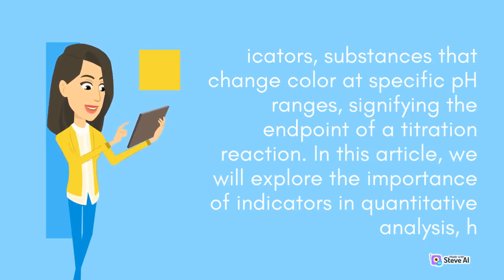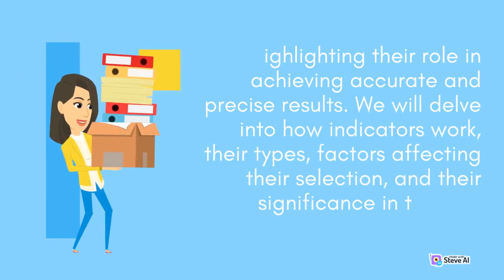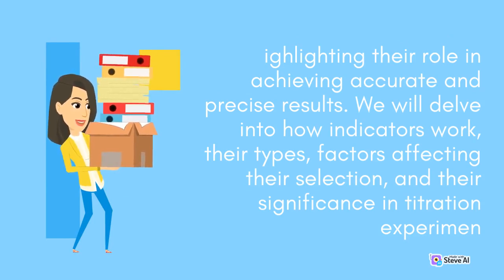In this article, we will explore the importance of indicators in quantitative analysis, highlighting their role in achieving accurate and precise results. We will delve into how indicators work, their types, factors affecting their selection, and their significance in titration experiments.